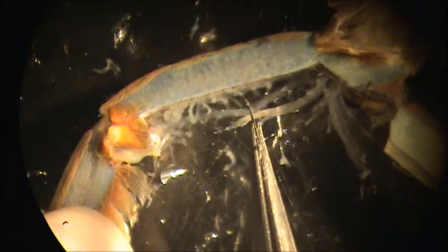Now I'm going to remove the nerve bundle, but it's better to separate the nerve bundle like this with this small insect pin, then to see the boundaries very well. Then you'll see that there are a lot of blood vessels there. Then we can use a blade to cut the nerve bundle at the end. Then we can remove the nerve bundle. Now it's ready to stain it.